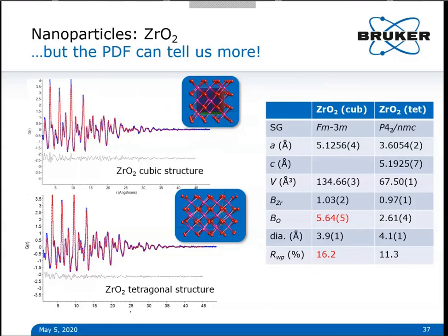So do you also measure the entire empty instrument, just the air, so to say? This is also possible. I think some people will do this. It can be important if you have, for example, a highly absorbing sample, because then it helps to calculate the absorption of both the material and the capillary material itself. In general, it's not something I will do. Usually you can skip that step and save yourself some time. Okay, that's nice.